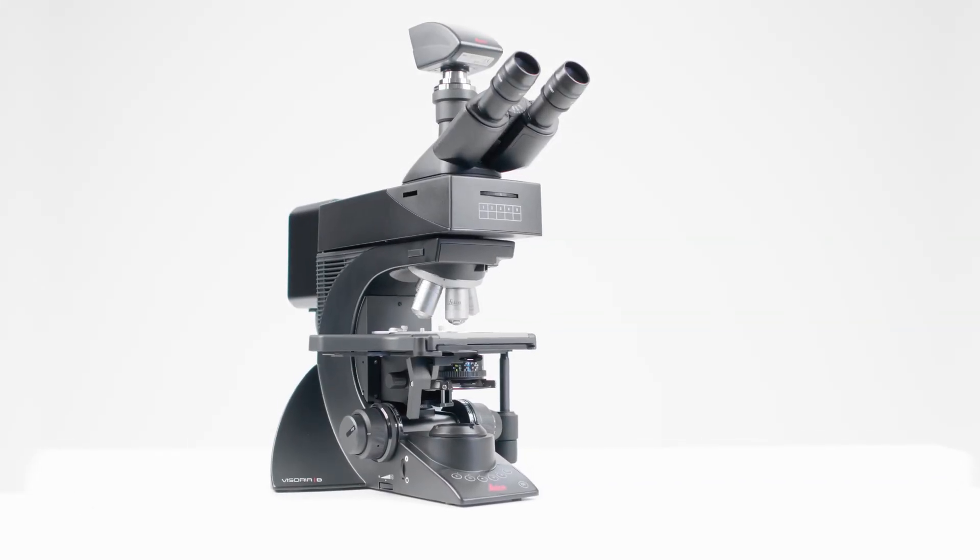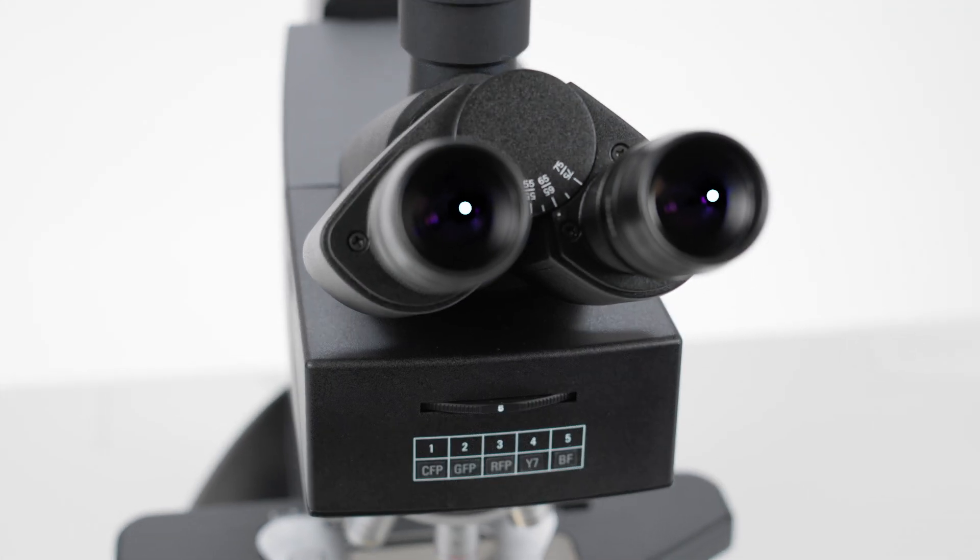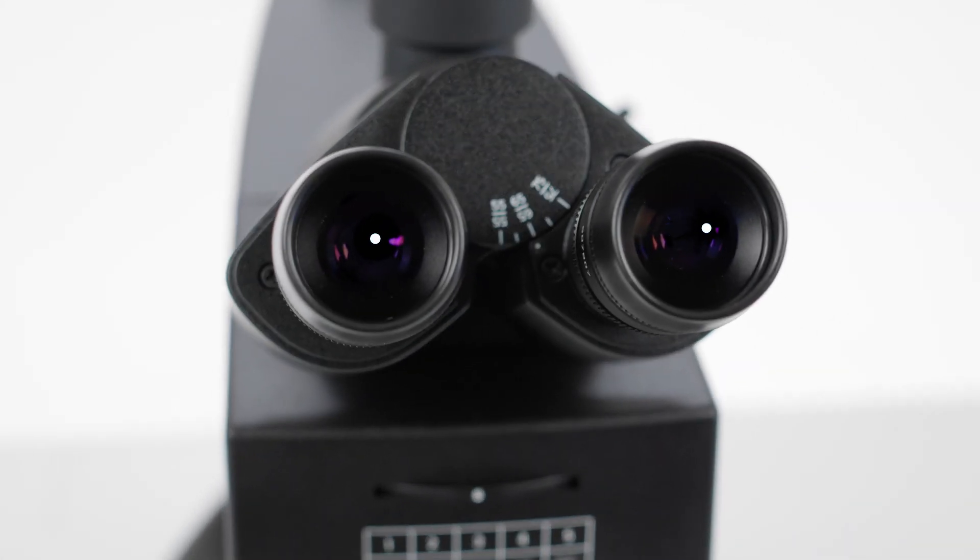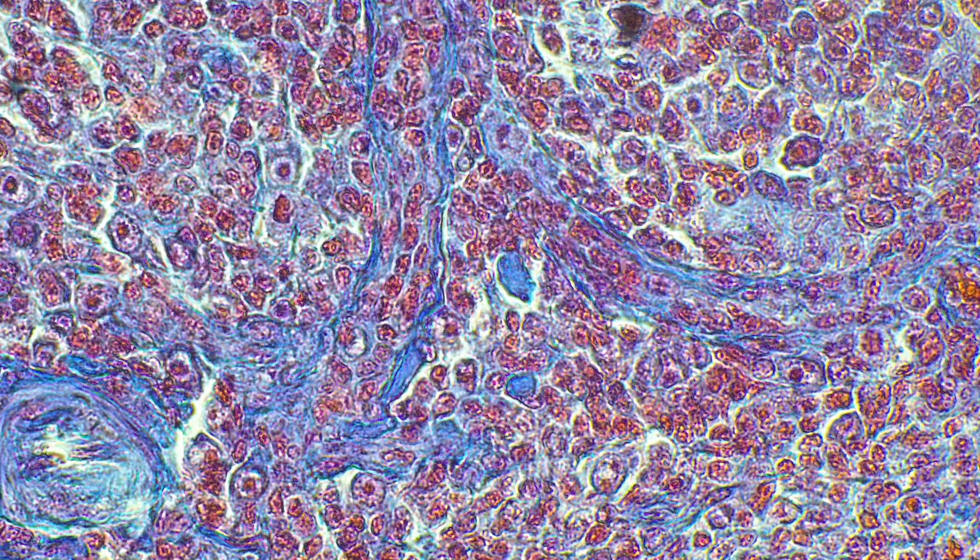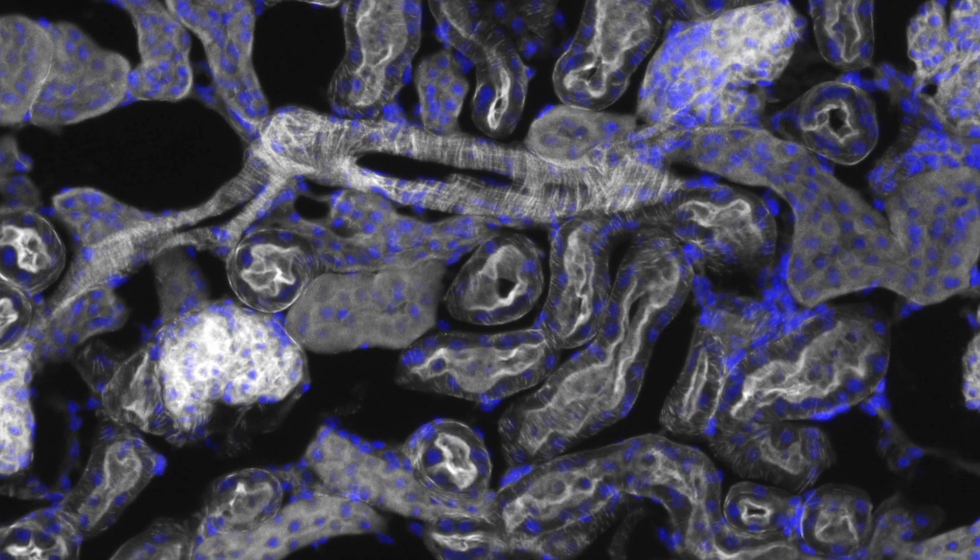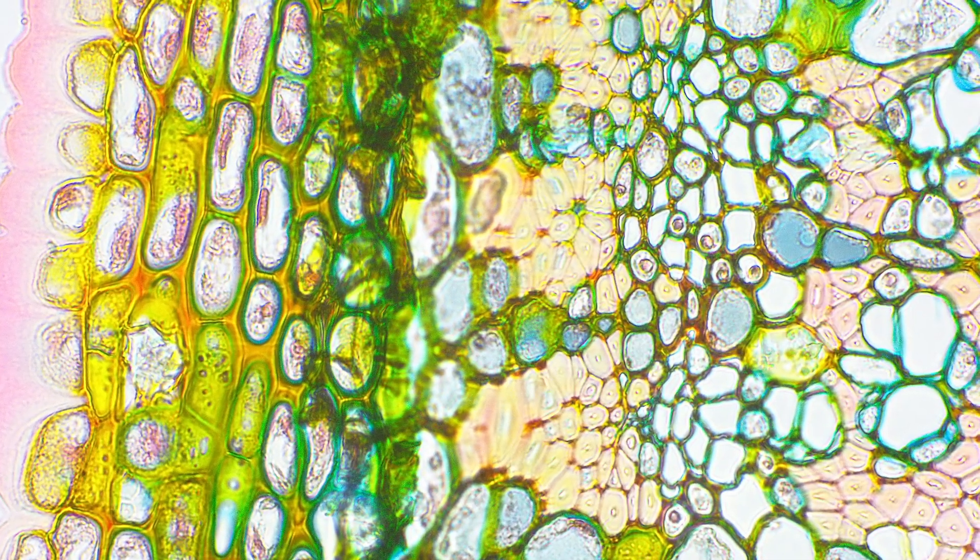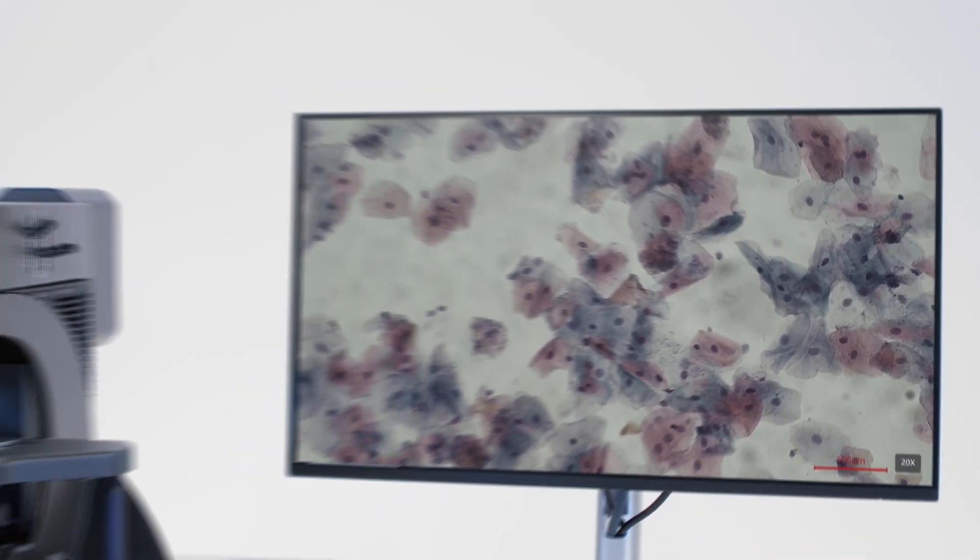The Visoria B Microscope is a solution designed for applications performed in life science and clinical laboratories. Made for your daily routine in life science studies including human and animal histology, plant anatomy and pathology examinations.